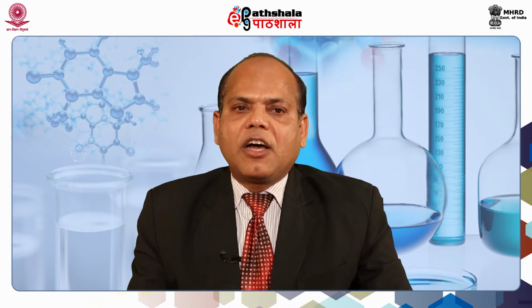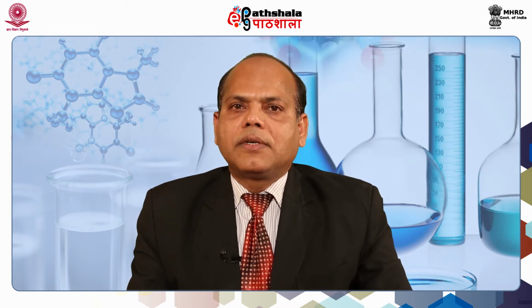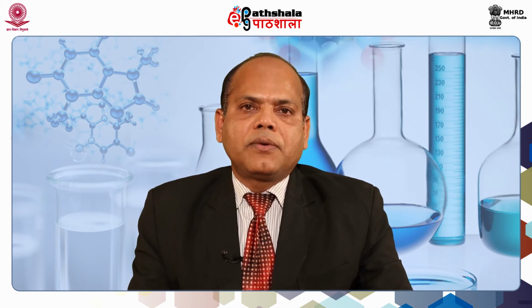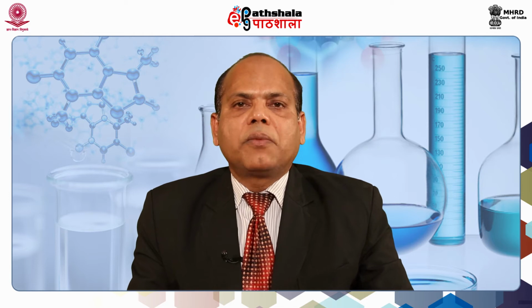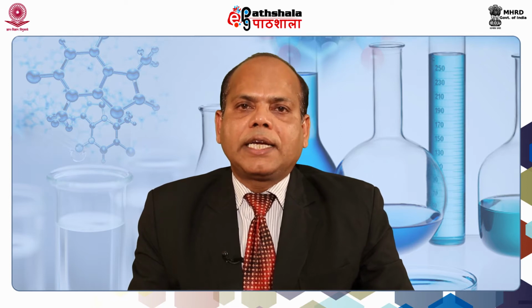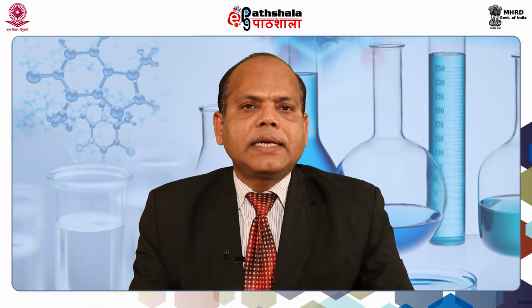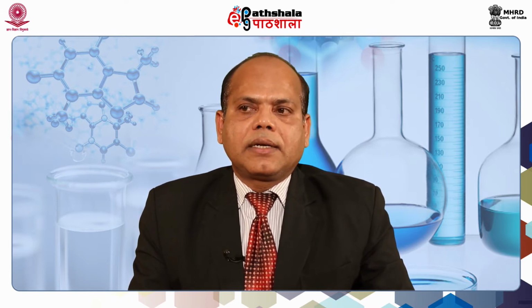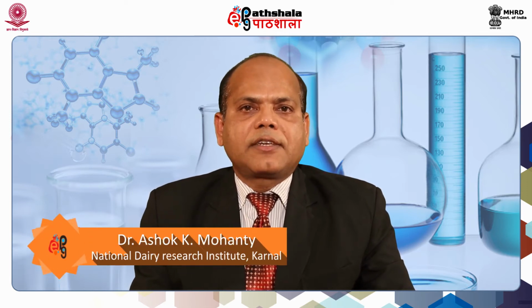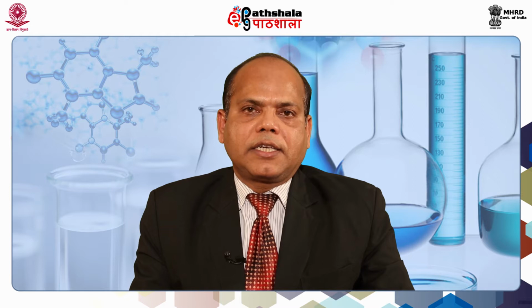Second thing is, if you identify the exact mass, it is not possible to know what particular protein it is. So, we have to digest this protein into small peptides, and those peptides will be subsequently introduced in the mass spectrometer, and it can be identified by using various softwares. The second aspect is that other small molecules of small molecular size can be extracted from the biological samples, which can be used for their identification and quantitation.